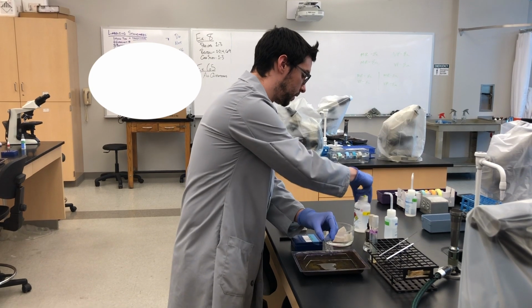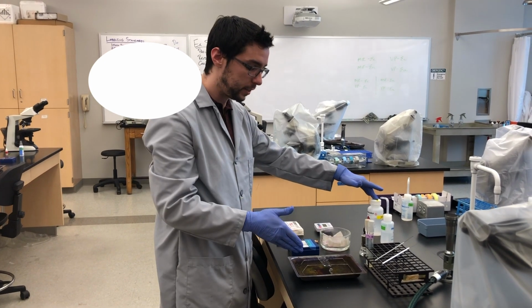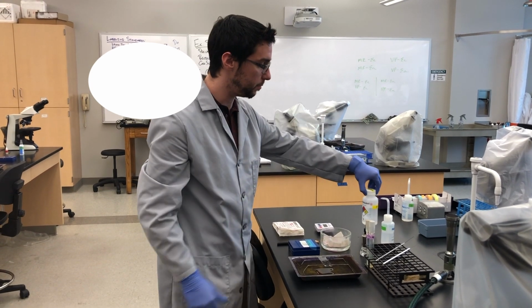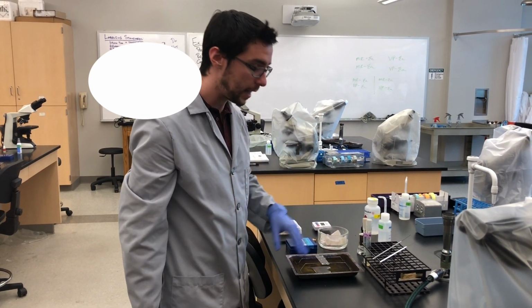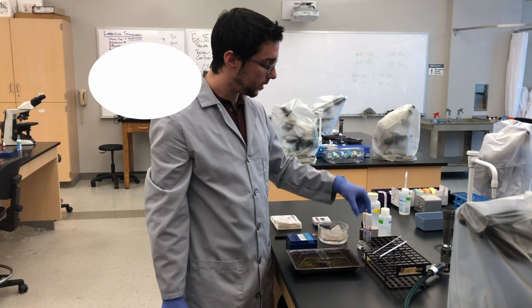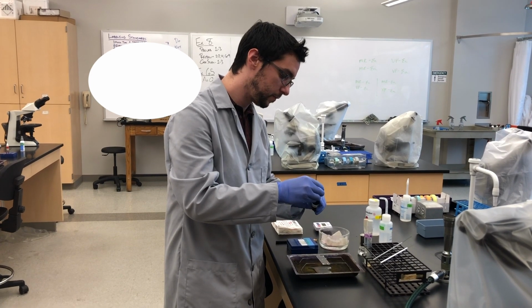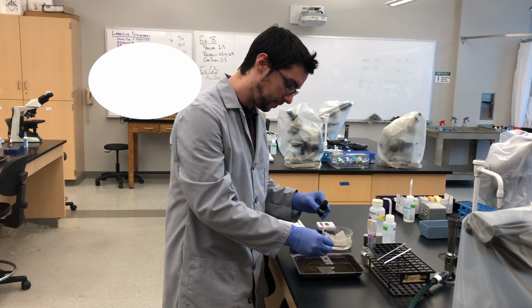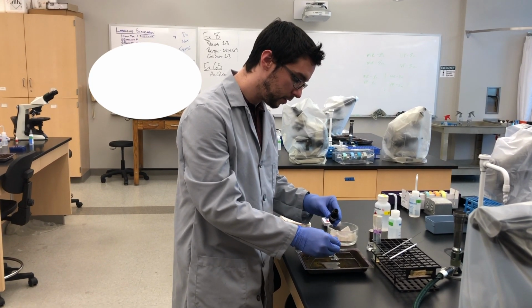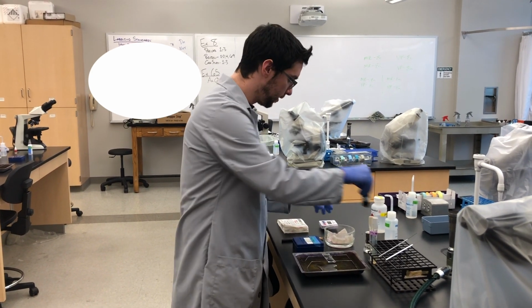Whenever you're doing this, make sure you do not accidentally use the ethanol decolorizing wash. Use your acid alcohol. We will have these appropriately labeled, so make sure you use that for your decolorization step when you're doing an acid-fast stain. Once we've rinsed the acid alcohol off with water, we can then come in with our counterstain, methylene blue. Again, simply add it to where you know you put your smears. Cover them completely. Let them sit for a minute.